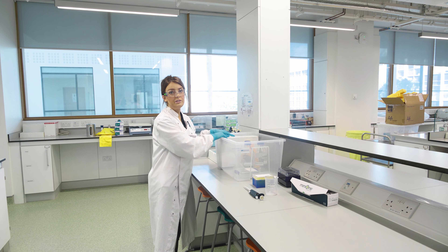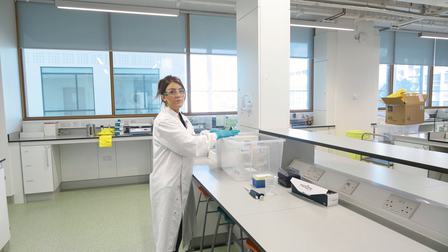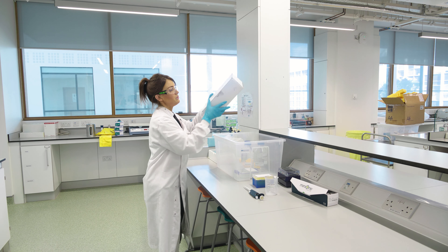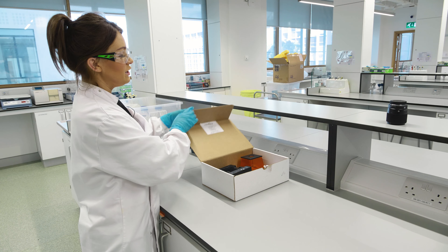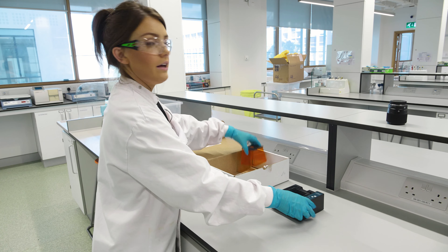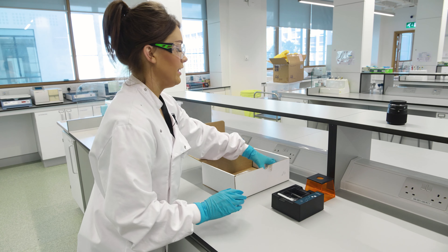Two groups of students can use the same gel, so you should set up three or four workstations for six students. Per six students, you should give them their mini one apparatus — the mini one tank, the lid that goes on it, and the adapter.